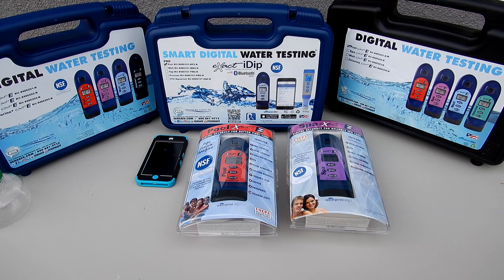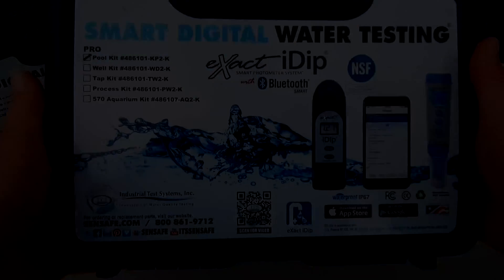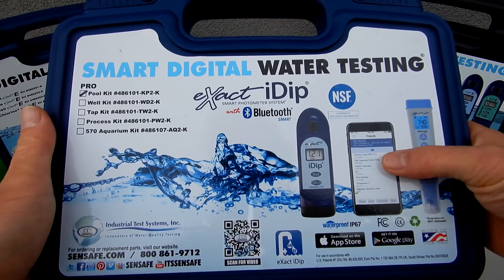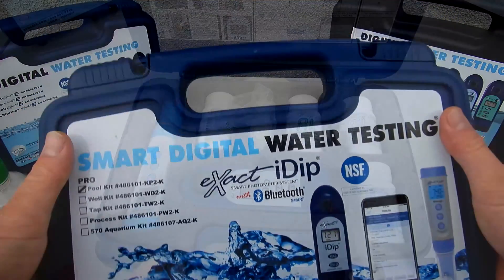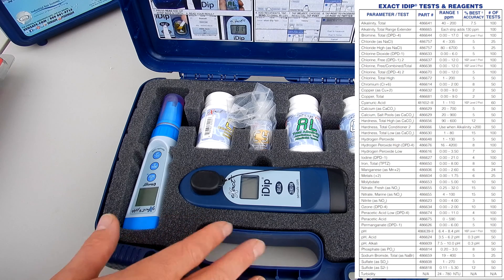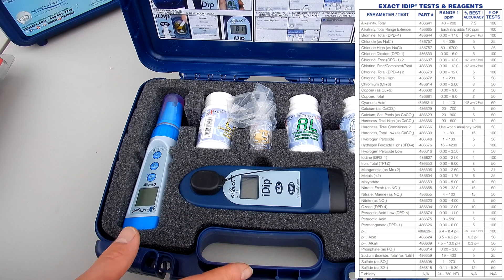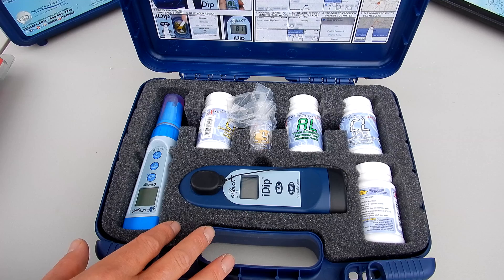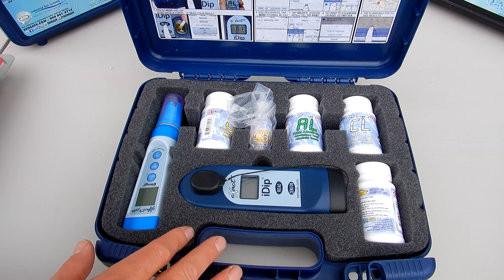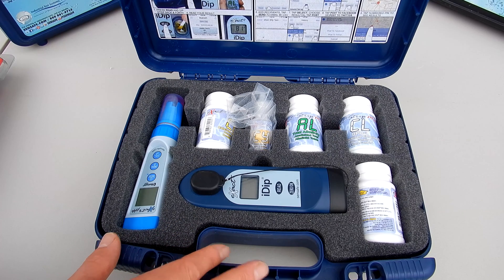In this video I'm going to go over ITS, Industrial Test System's lineup of exact photometer testers for your pool and spa. In a previous video I showed you the Pro Kit, which comes with the exact iDip plus a digital meter. Now this particular kit does over 40 test factors. You may not need 40 test factors for your pool and spa route, or if you're a homeowner you may need something a little less intensive. I'll go over the other models of the exact photometers for you.